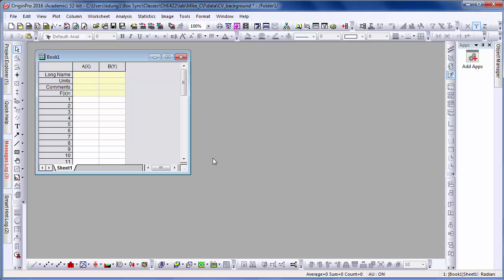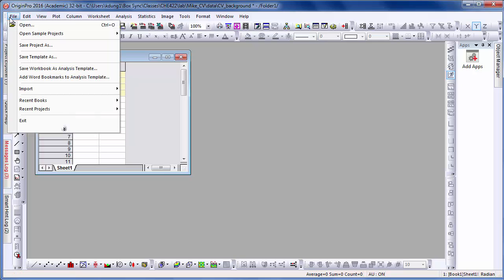Okay, in this video I will show you how to use Origin to prepare your graph for the cyclic voltammetry report.